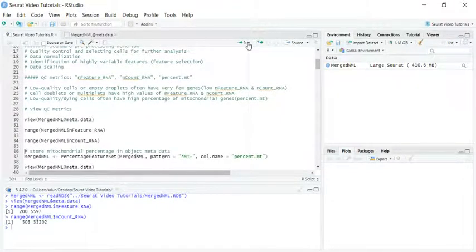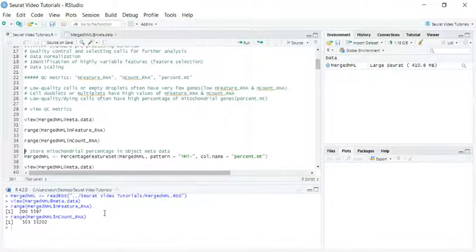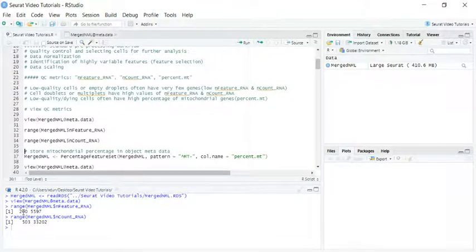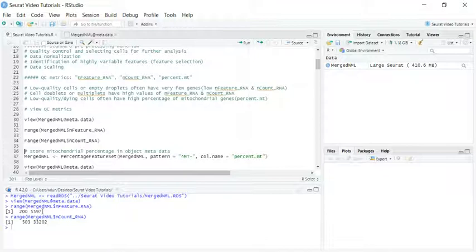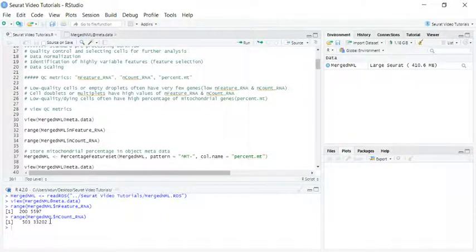You can see that in our object, the lowest n-feature is 200. You probably remember that when we created the object, we selected cells that had more than 200 gene expressions, so the lowest number is 200. The highest n-feature is 5,597. For n-count, the lowest number is 503 and the highest number is more than 33,000.